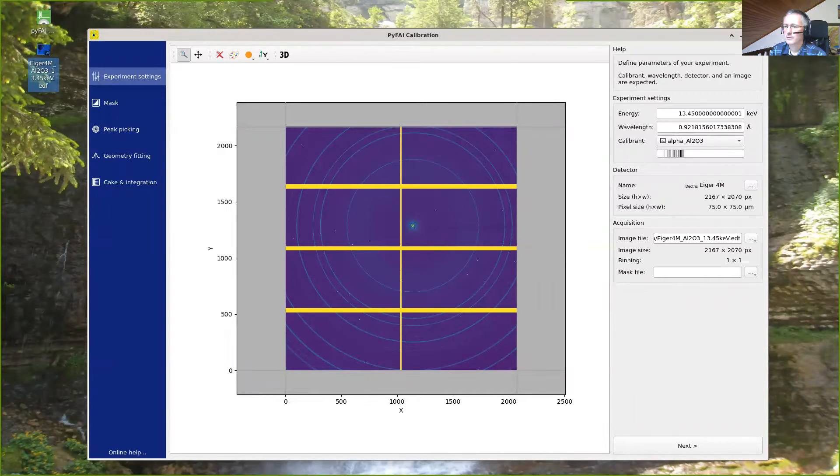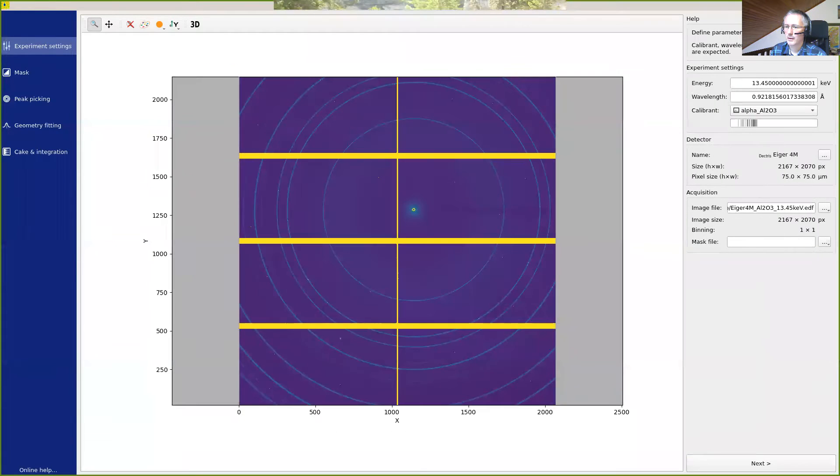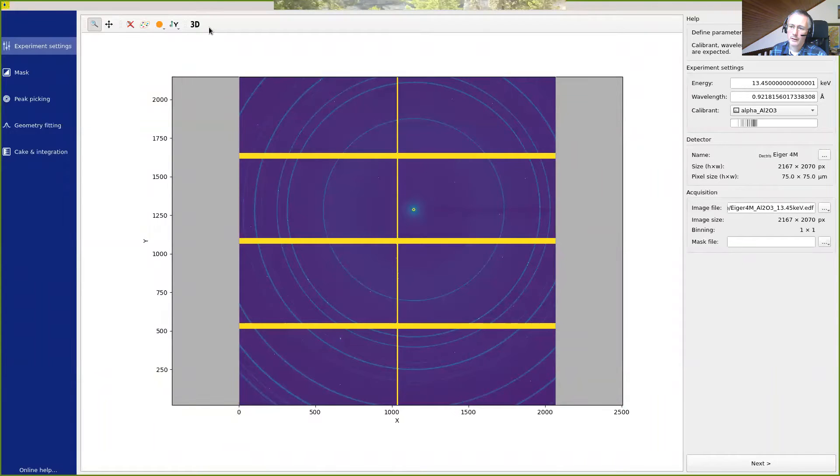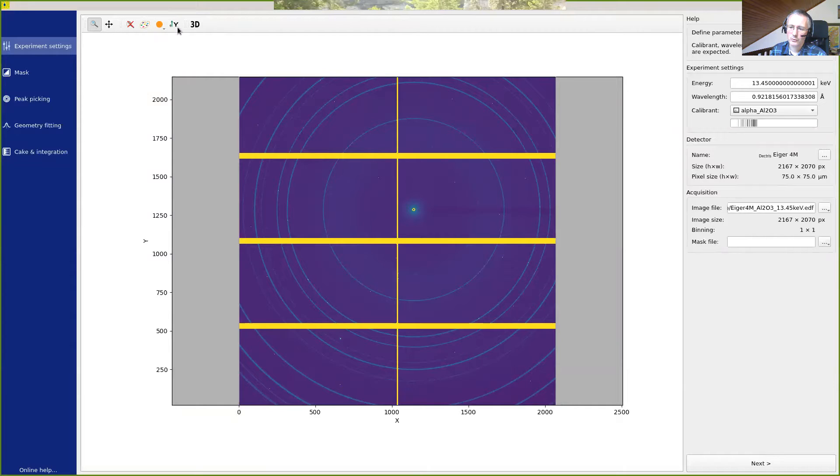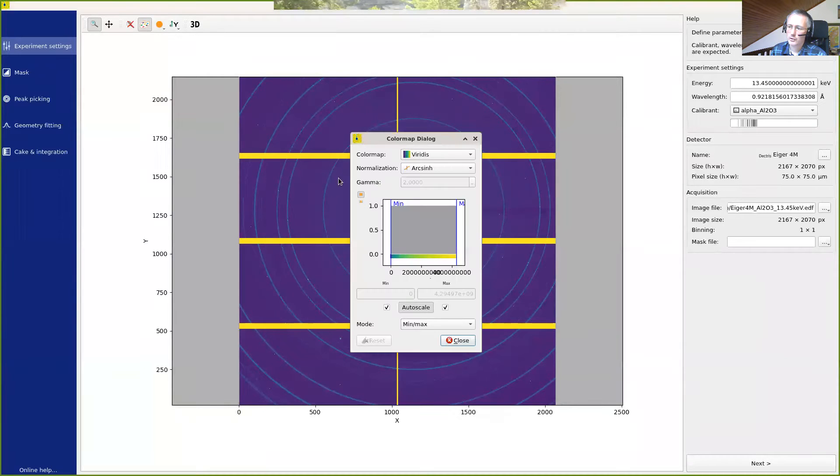So let's maximize the image. Here we have the control button from Silex, which allows us to change the aspect ratio of the image, to change the position of the origin, which is at the lower left of the image, or change the color map, for example, with the normalization pattern.